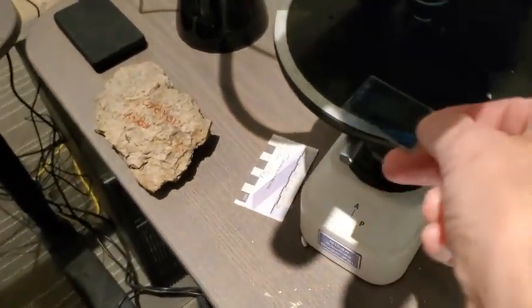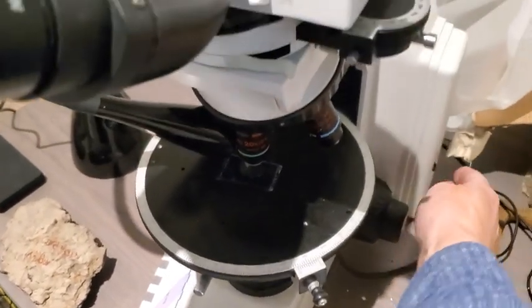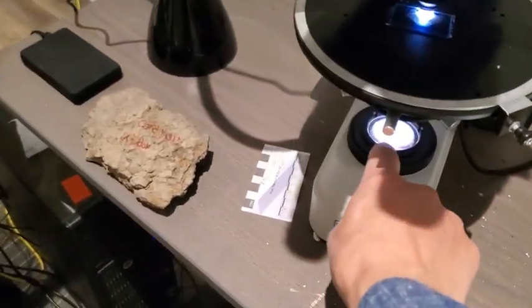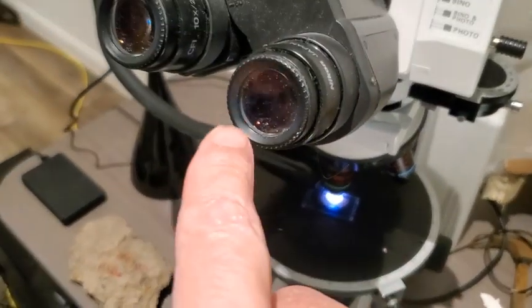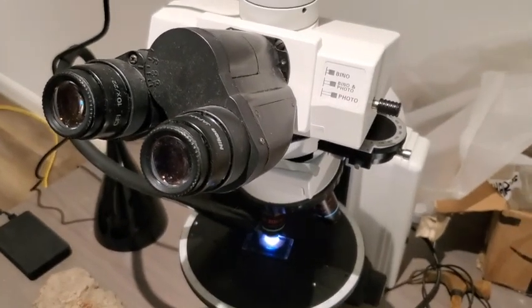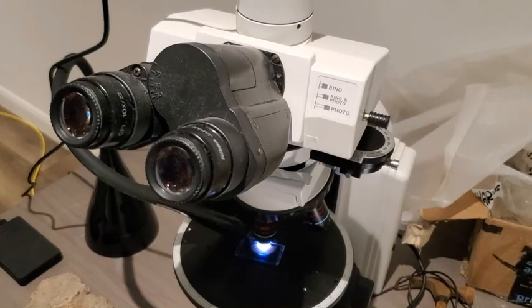But then we take this thin section and we place it on the turntable of the microscope. And we turn on the microscope, and you see there is polarized light shining through the thin section, and then I can observe through the binoculars and the oculars, right?